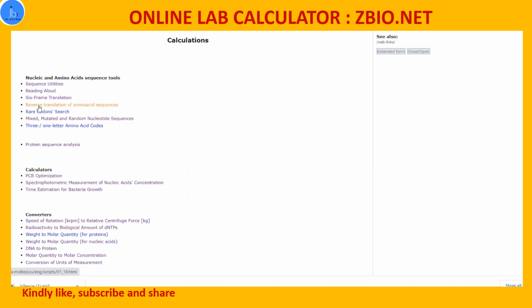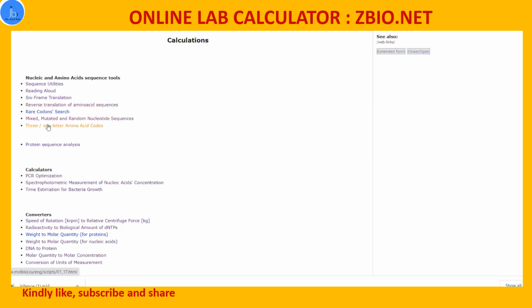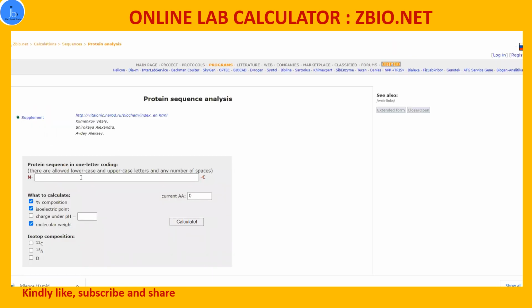Similarly, for reverse translation of amino acid, if you want the reverse translation information, then you have to paste your protein sequences and then you get the ideas about that. Similarly, other mutation tasks and protein sequence analysis you can also do. For protein analysis purposes, we mostly use ProtParam, like ExPASy is a very wonderful database and resource. We mostly use ProtParam for those kinds of analysis, but similar tasks can be performed here also. If you paste your protein, it will give you ideas about your protein analysis also.